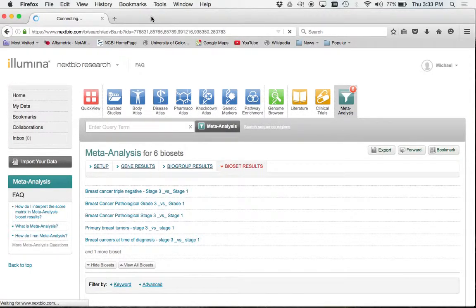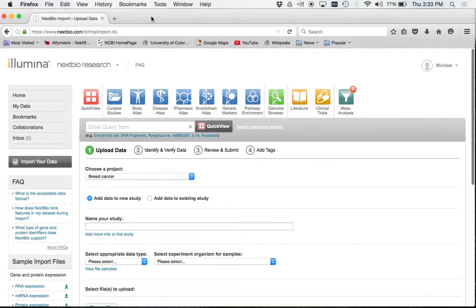That's the best thing about this, is I can take any gene list I want, throw it into this, and it'll compare it to 20,000 different gene lists out there. It then ranks them based on their correlation to those gene lists. What's at the top of those lists basically tells you what kind of gene list you have, and what kind of processes it's related to.